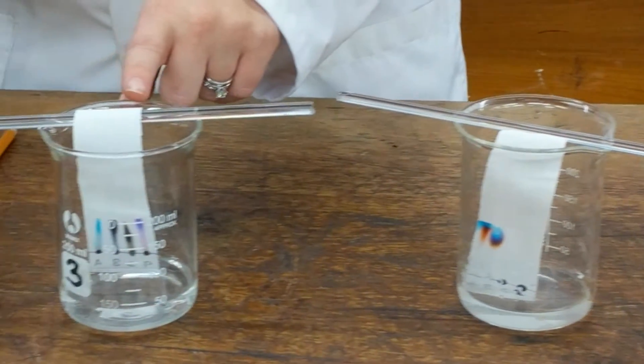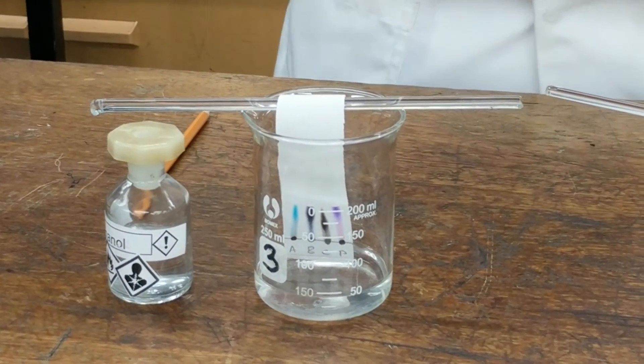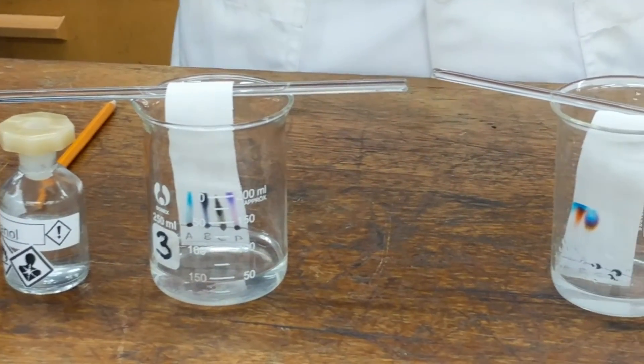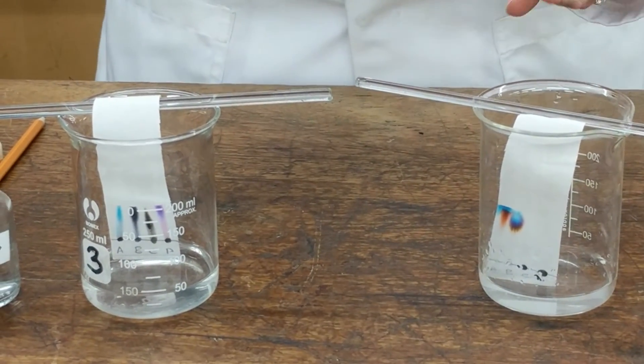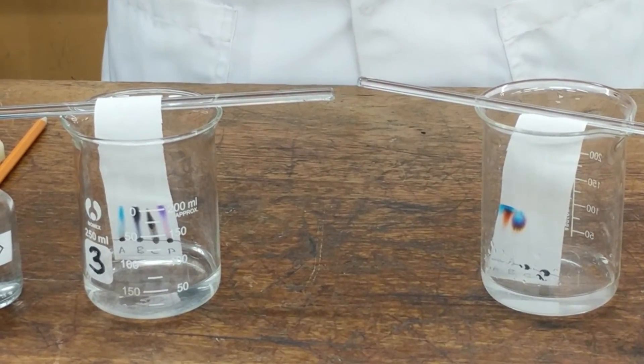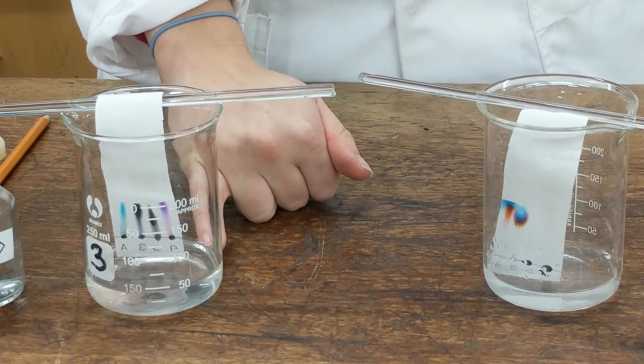However, over here, all four of them have moved over. This is because some inks are soluble in water, some are not. The permanent markers, which were actually points C and D, are not water-soluble. However, they will dissolve in another solvent, such as ethanol.